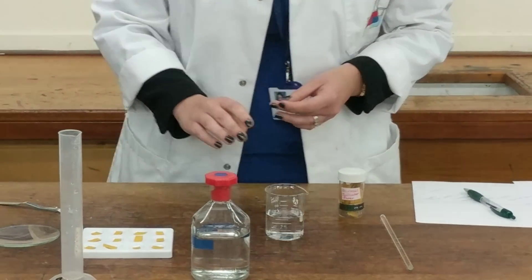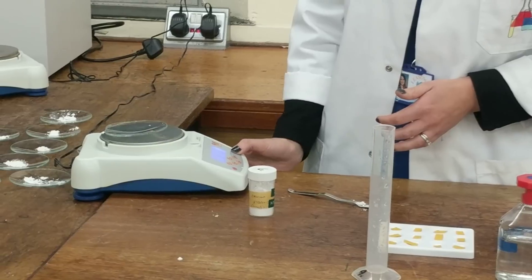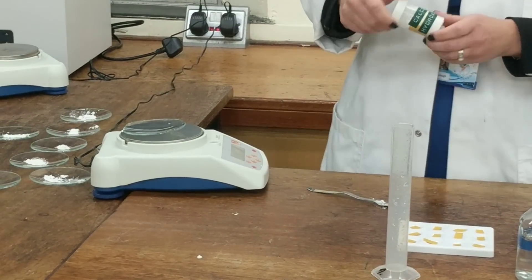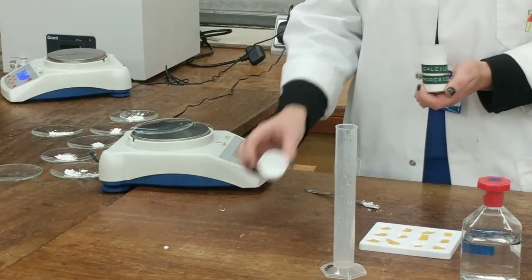We'll then need to weigh out on a watch glass, on our balance, 0.3 grams of calcium hydroxide. We'll be adding 0.3 grams each time.